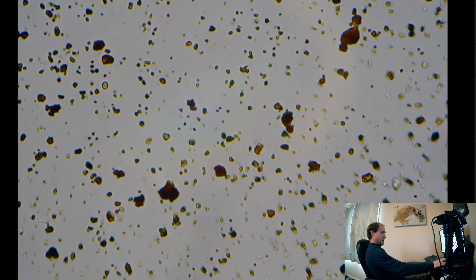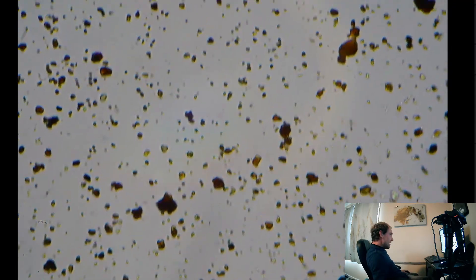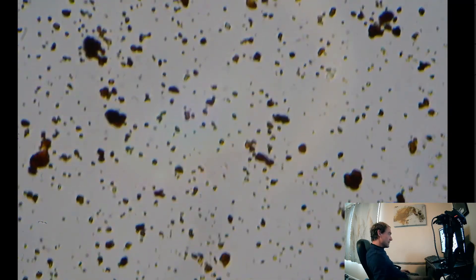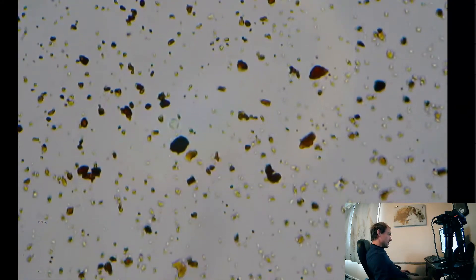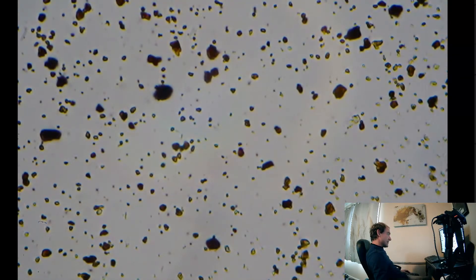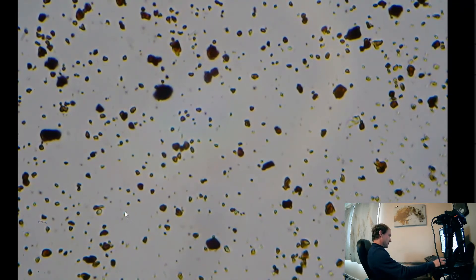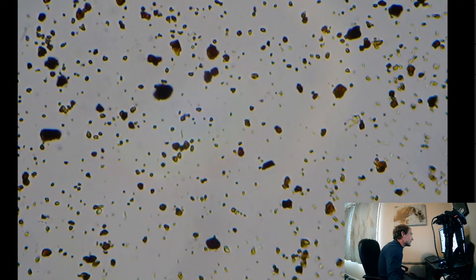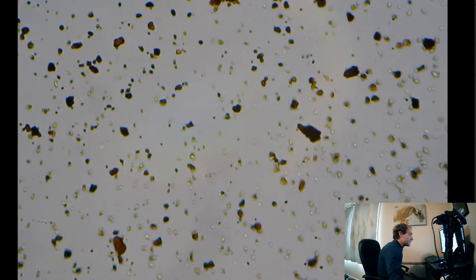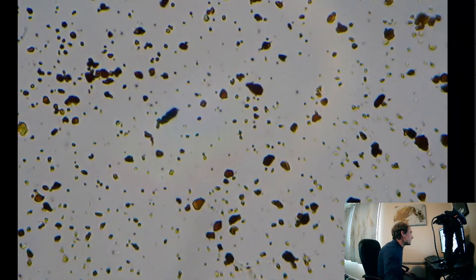Let's give you a little bit more ISO. Yeah, don't take a short little scan around here. Feel free to ask any questions in the chat or in the comments if you're watching this later. Yeah, there's quite a bit of bacterial life in this. Got a bacillus shape right there. All sorts of movement. It looks pretty cool.